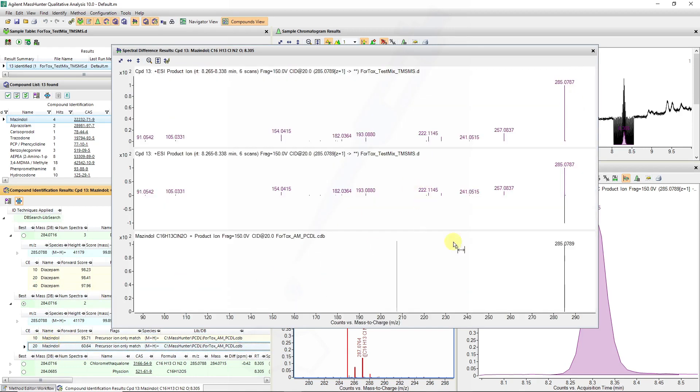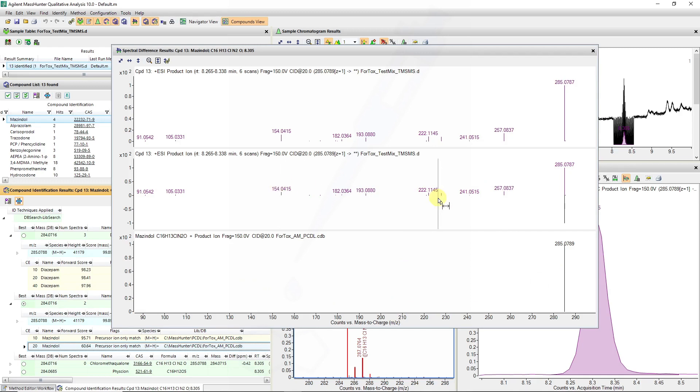You can see we don't have a very good library spectrum for mezindol and some of these are not good matching, hence why our forward scoring is potentially not as good.